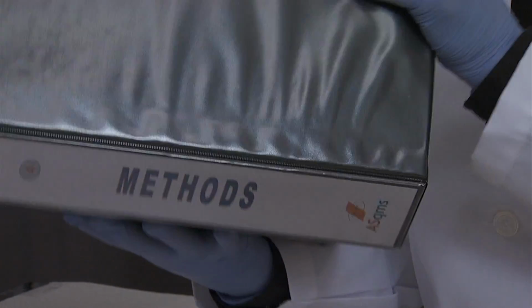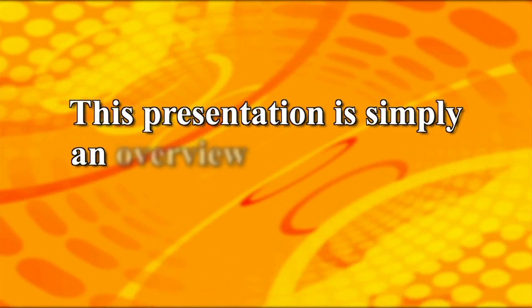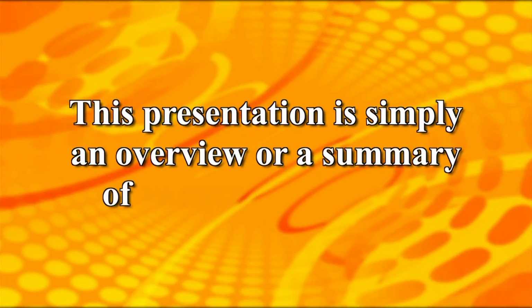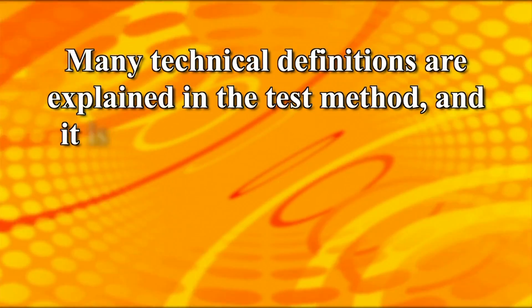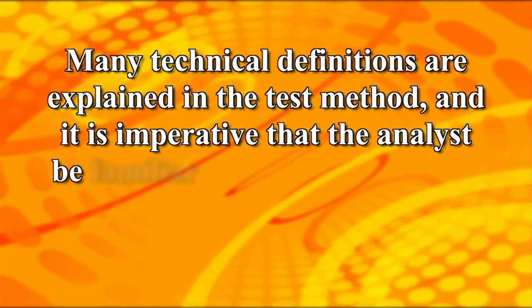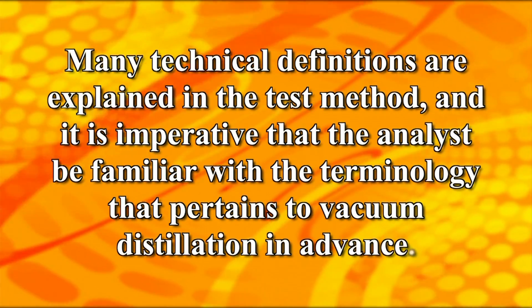Before attempting this technique, it is mandatory to read the test method in its entirety. This presentation is simply an overview or a summary of vacuum distillation. Many technical definitions are explained in the test method, and it is imperative that the analyst be familiar with the terminology that pertains to vacuum distillation in advance.